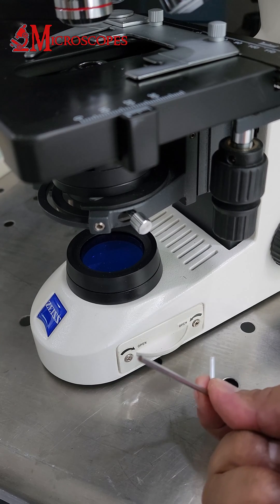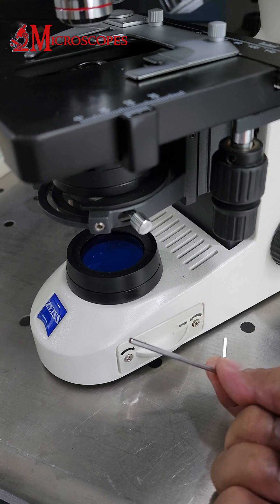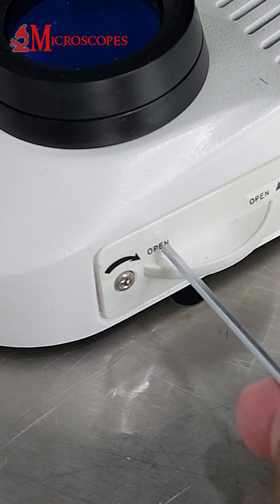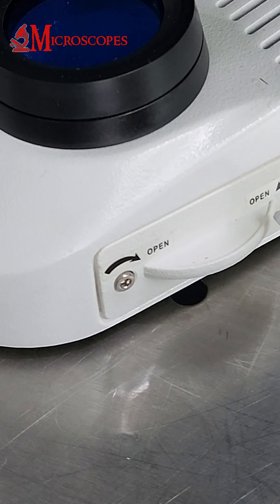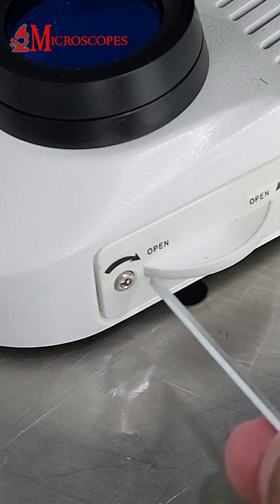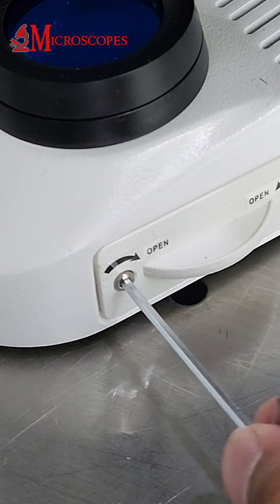How to Replace a Halogen Bulb in a Zeiss Primo Star Microscope. Start by using a 2.5 millimeter hexagonal wrench to wind along the arrow for about half a turn.